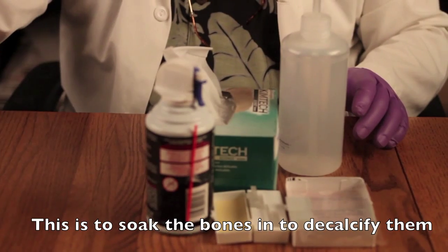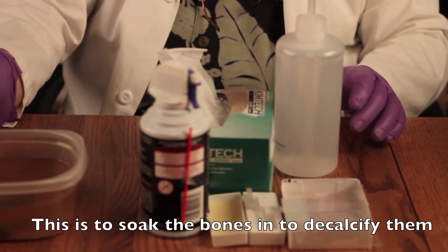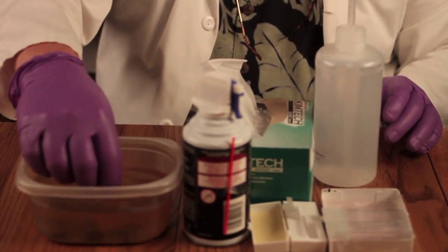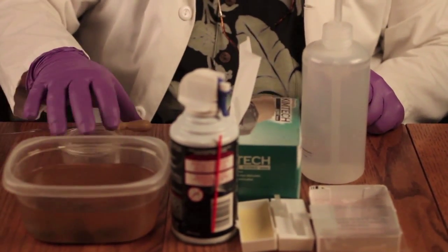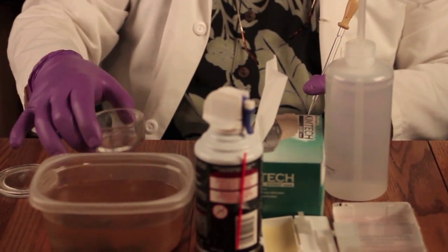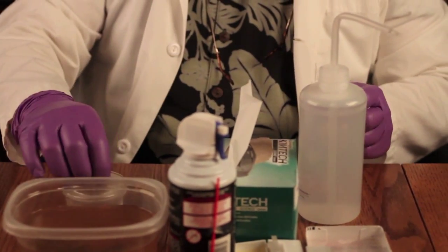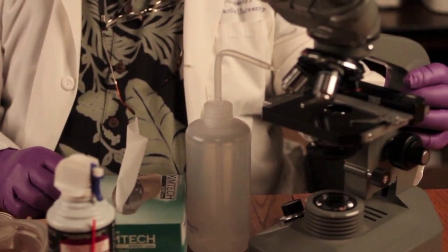You're going to need the solutions from the bottom of your vessel from the decalcification, because that's what you're going to pipette out after the bones have soaked for a while. You'll also need some pipettes — I like to use glass Pasteur pipettes — and a vessel to put your solutions in. Finally, you're going to need a good high-quality compound light microscope to examine your slides after you've made them.